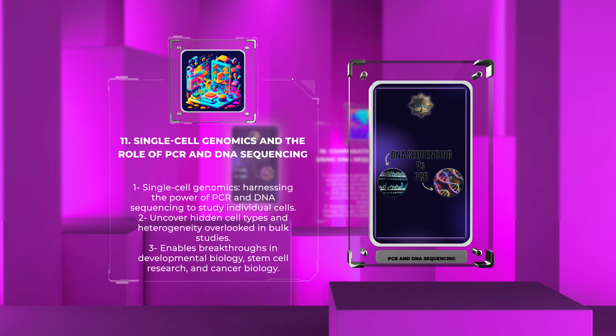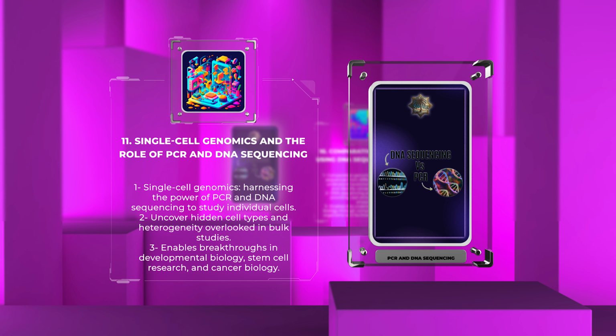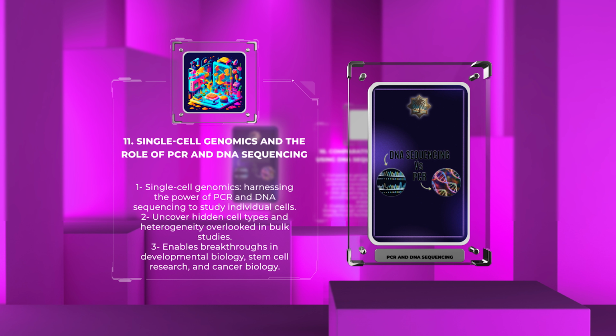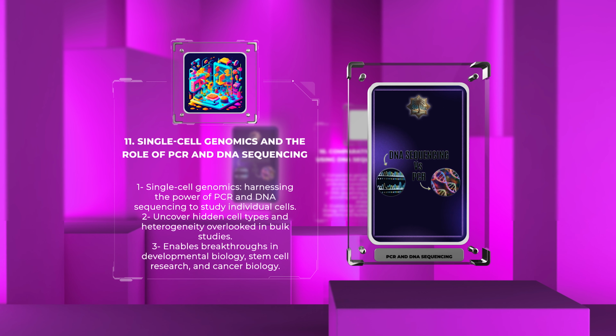intricacies of individual cells. This technique uncovers hidden cell types and heterogeneity overlooked in bulk studies. Amplification of DNA from single cells enables library preparation and sequencing, leading to breakthroughs in areas like developmental biology, stem cell research, and cancer biology.